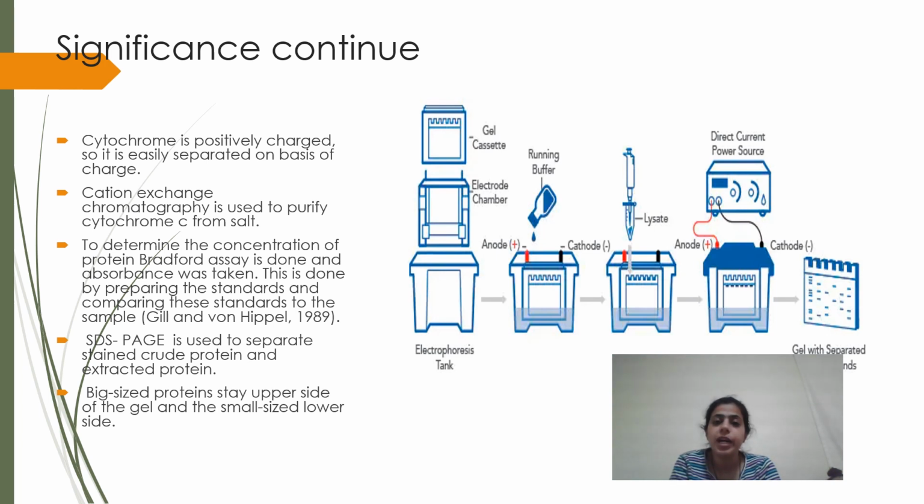To analyze the quantification of the protein, we use the Bradford assay method. This method is based on Beer's law. Beer's law states that the absorbance is directly proportional to the concentration of the protein, and in this the absorptivity is constant.